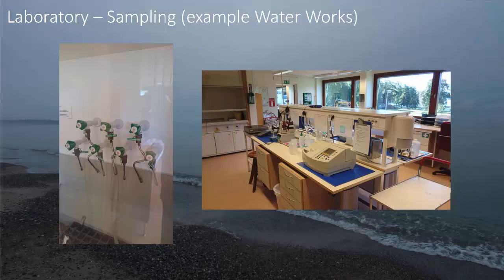This is again from a waterworks. In a sewage treatment plant you have to be careful with the length, of course, of the pipes and the risk for clogging and so forth. And also in the case of the waterworks you have to look at the length of the sampling lines in regard to risk for bacteria and so forth, so you don't get any wrong analysis.